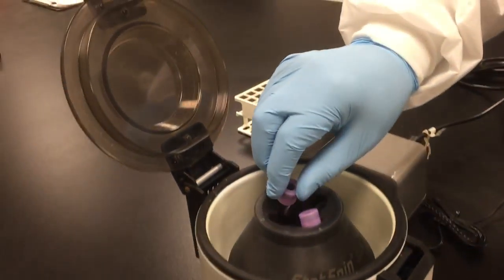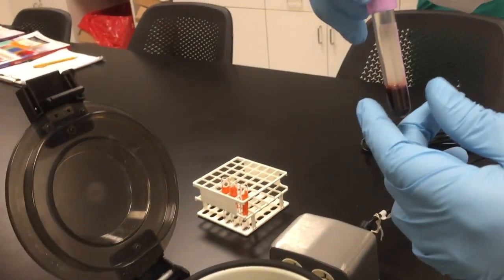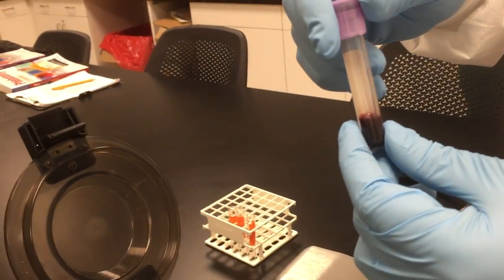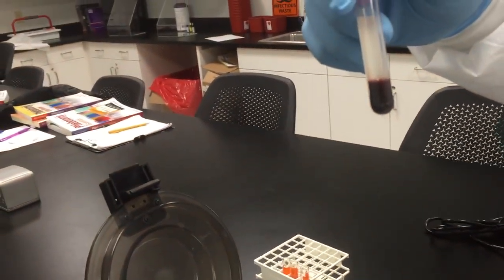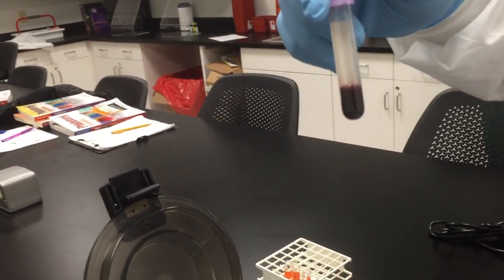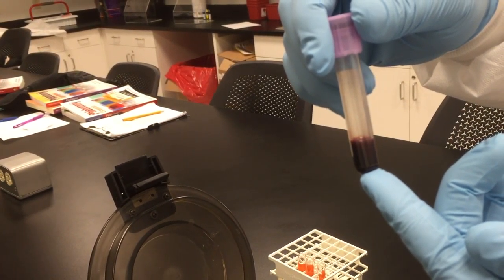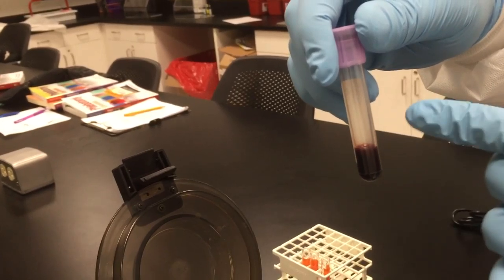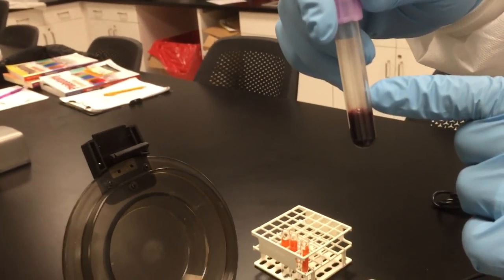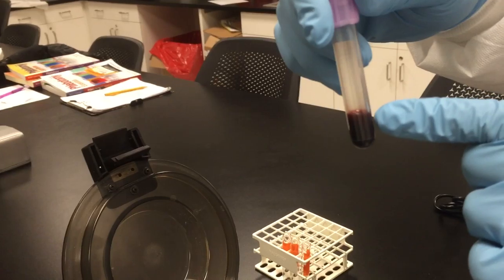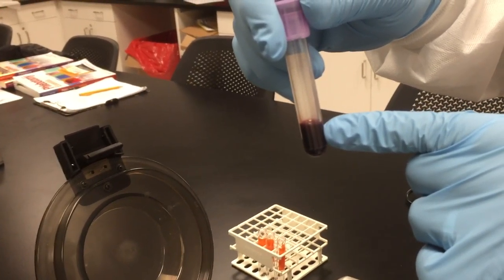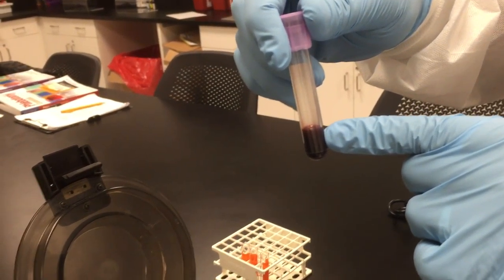You take out your test tubes. And normally, this would be separated. The bottom of the tube would have red blood cells. The top of the tube, because it is a lavender top, would have plasma. And in between would be what is called the buffy coat, which would be less than 1% of the total makeup.